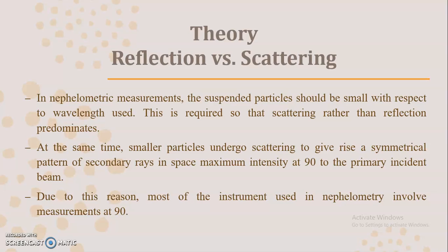So whether reflection or scattering predominates largely depends upon the particle size. If small particles are there, then scattering will occur, which also shows the Tyndall effect, and at that time we can use nephelometry. Remember, when the scattering effect is occurring, we measure the intensity at 90 degrees. So this is about nephelometry.